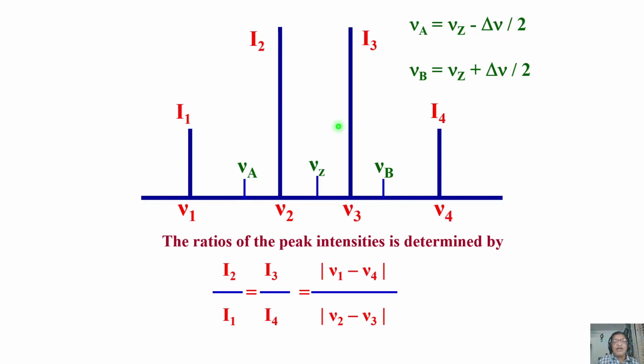This is what happens. So, what does it tell you? Depending on the spectrum, depending on the chemical shift, depending on the separation or J coupling, your spectral intensity pattern drastically changes. Don't forget this. Depending upon the spectral information like J coupling strength and chemical shift separation, your spectral pattern and intensity pattern change drastically. That is a very, very important thing.